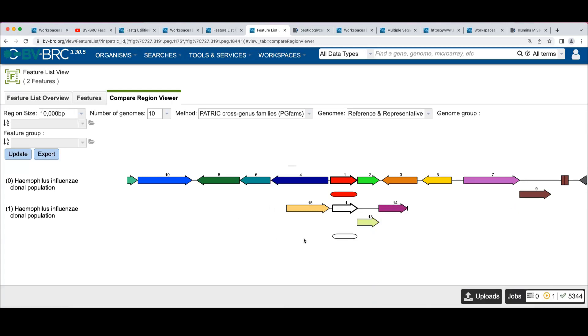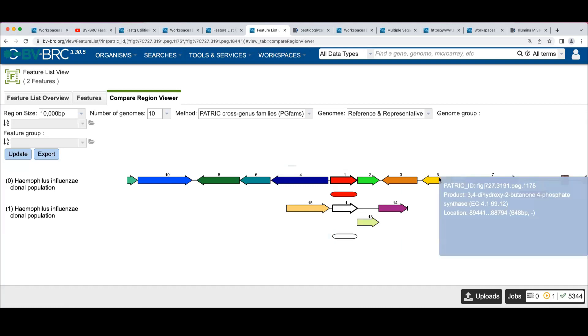Yeah, let's see. I would also look at the contig and see if it was bigger. This is the whole contig here, right? I mean, you can spend a lot of time going down rat holes.